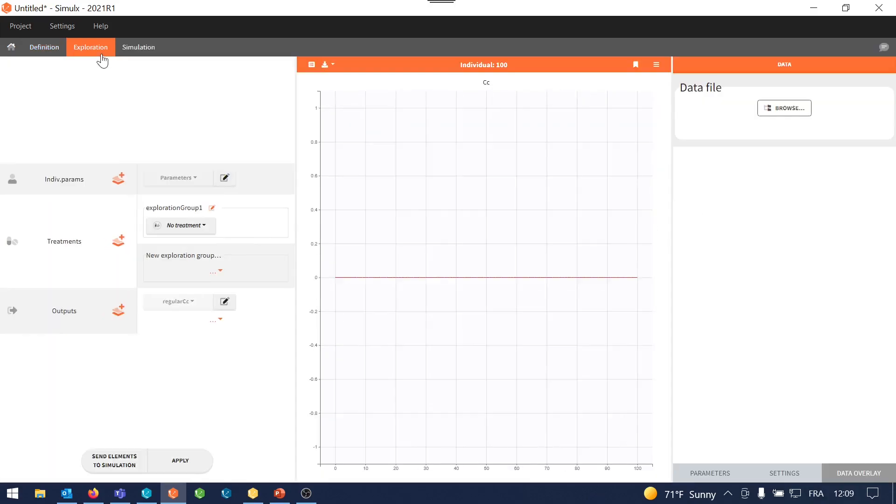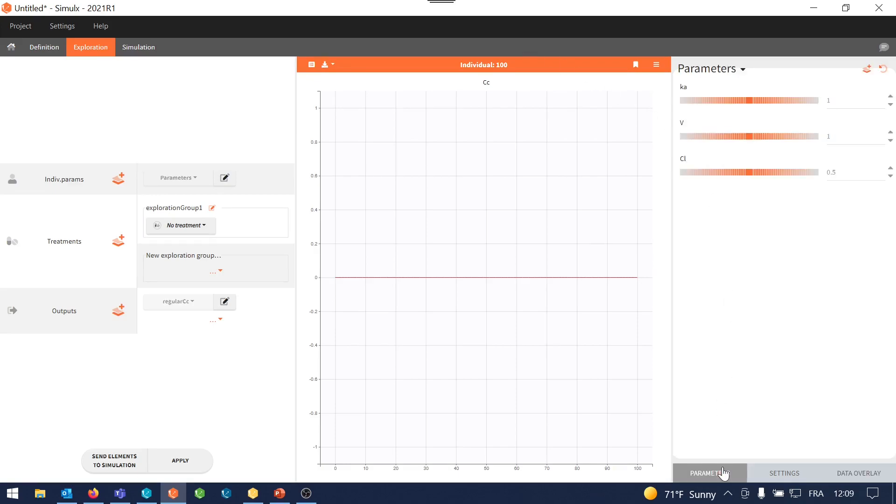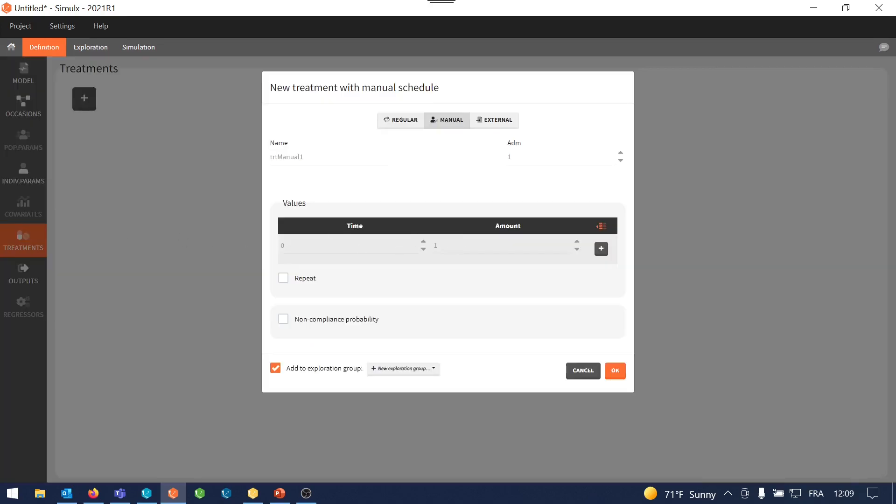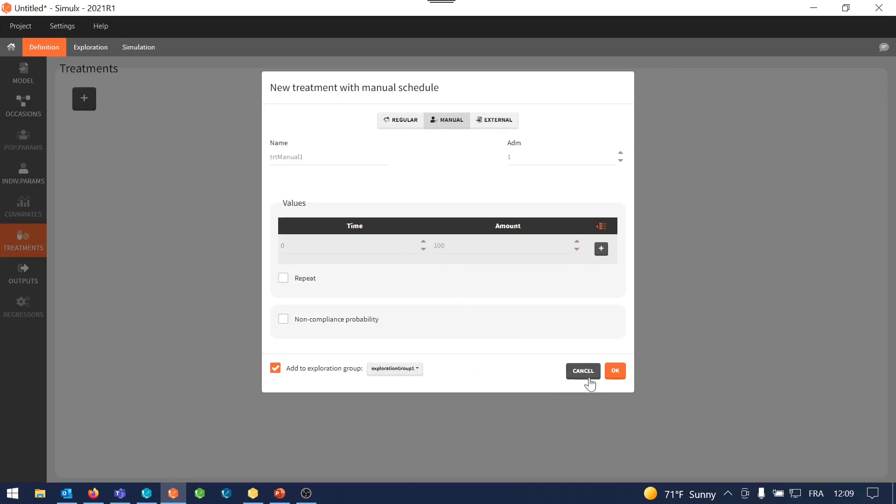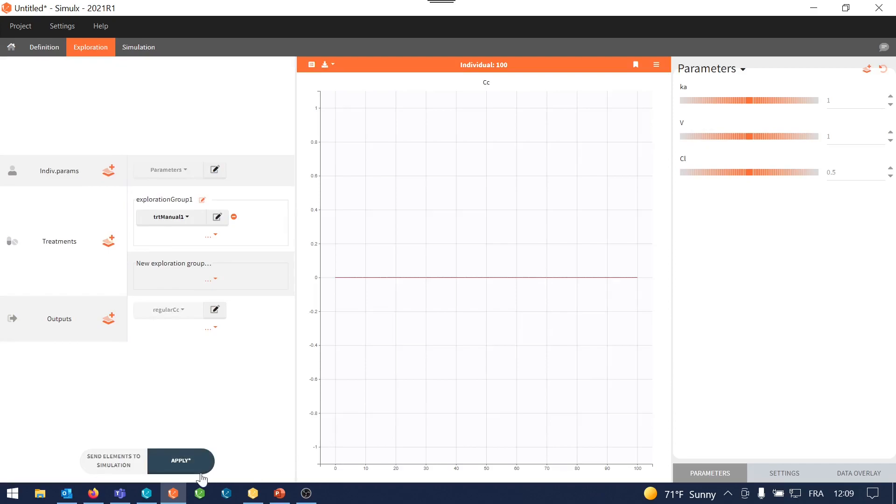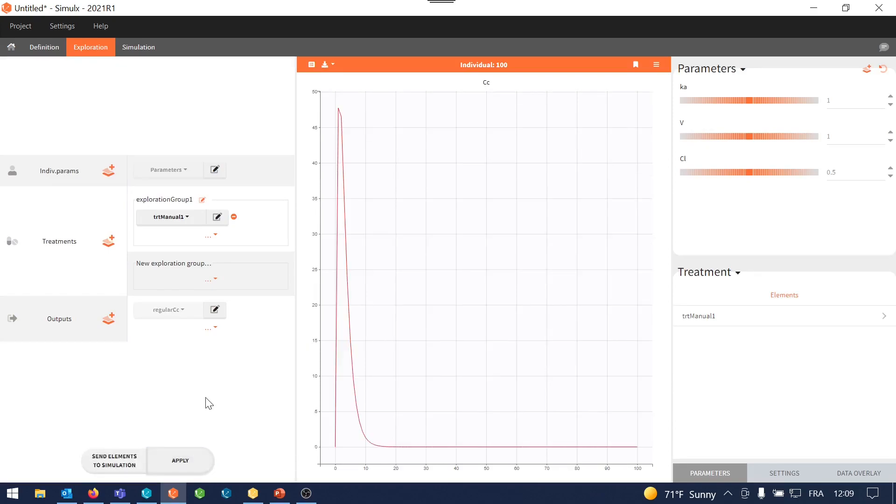In the exploration tab, I can check what the prediction would be for an individual with these default parameters, which are located here, and without treatment. So I will quickly create a 100 milligram treatment and add it to the exploration group. And this way, when I apply, I can see the response of the model for these parameters and to 100 milligram oral absorption of warfarin.